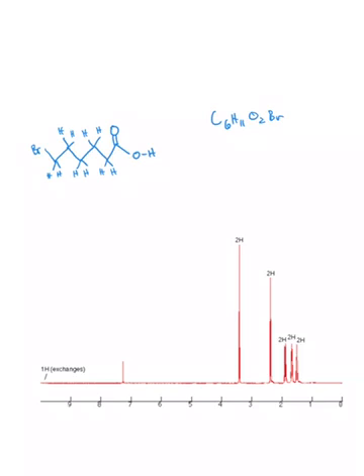So now we're going to examine proton NMR, where we can get a good idea of what our structure can and will look like. So let's recall our chemical formula of the compound we were observing, which was C6H11O2Br. On the left-hand side, here we have a potential structure for that formula, where we have 6 carbons, 11 hydrogens, 1 bromine atom, and 2 oxygens.